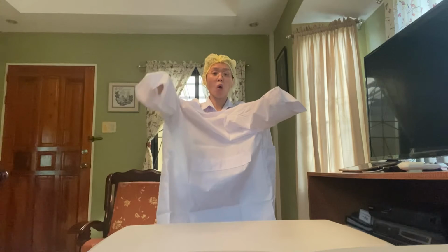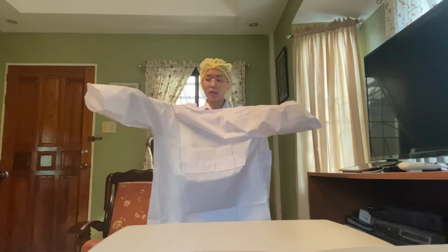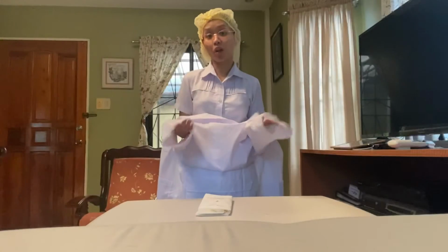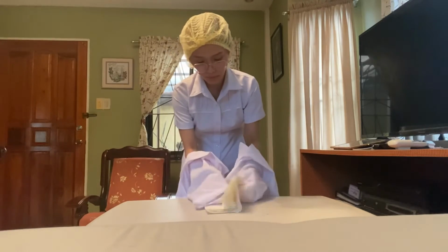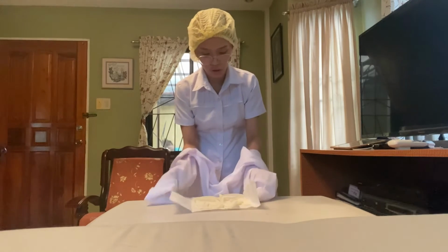Make sure that your fingers are behind the white cuff, or make sure that you do not go all the way out of the gown. So now I'm in my gown and my fingers are behind the white cuff. It's time to glove using the closed gloving method. So now I will open the package of my gloves and we will do the left glove first.